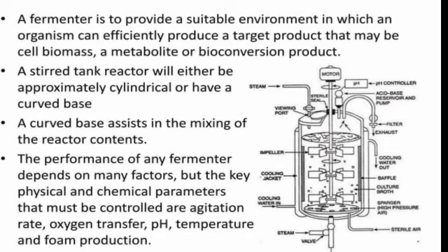The performance of any fermenter depends on many factors, but the key is the physical and chemical parameters that must be controlled, after agitation. So, I should have a proper agitation rate, that is the mixing rate. The oxygen transfer has to be optimal. pH, temperature, foam production, all this needs to be maintained.